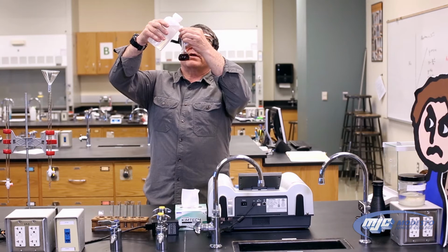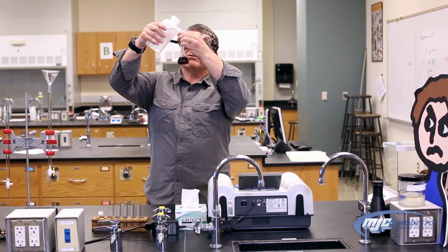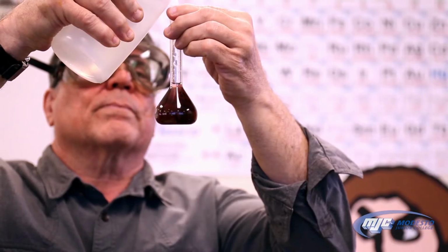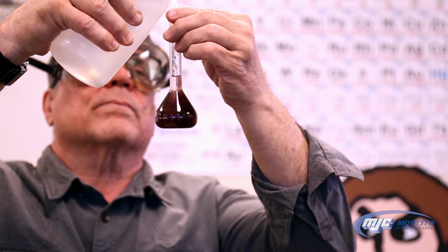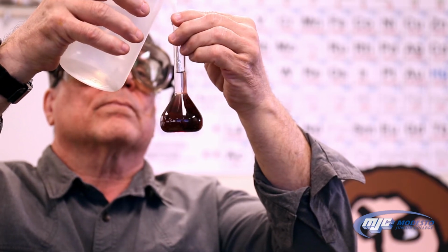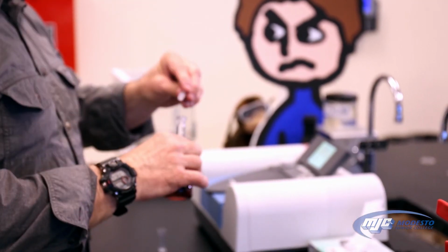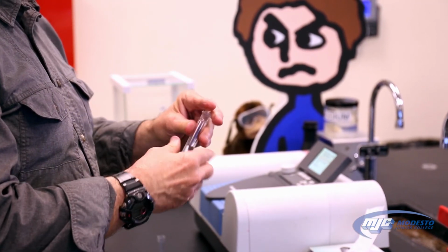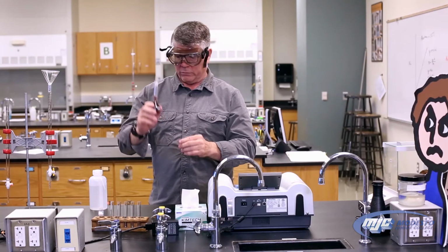This is the part we have to be careful about. If we go over, there's no taking it back out, and we have to remake the entire solution. There. Now that we have it filled up to the line, put the stopper in again, invert it. Now we have our stock solution.